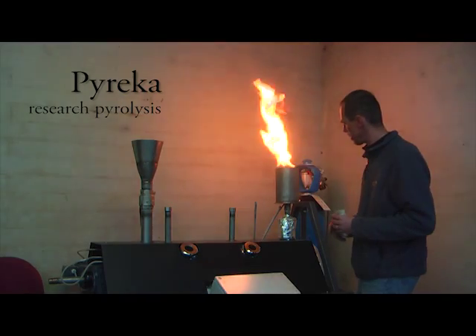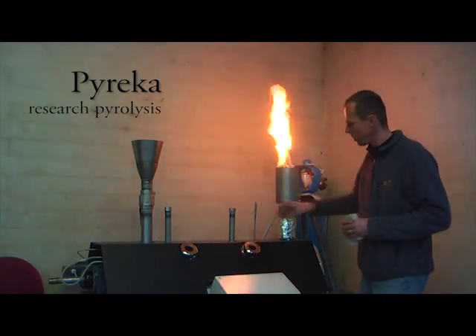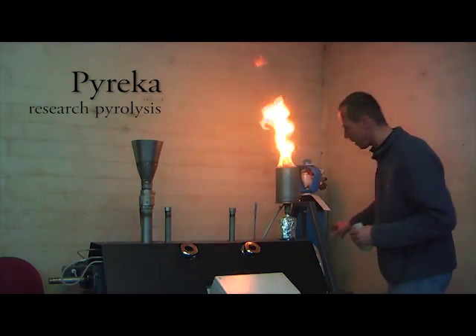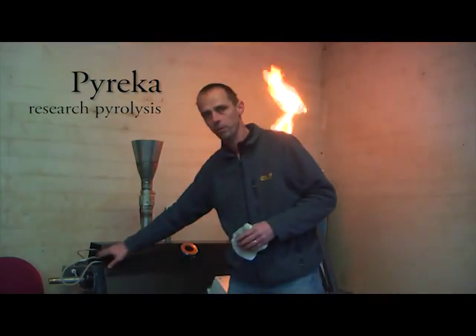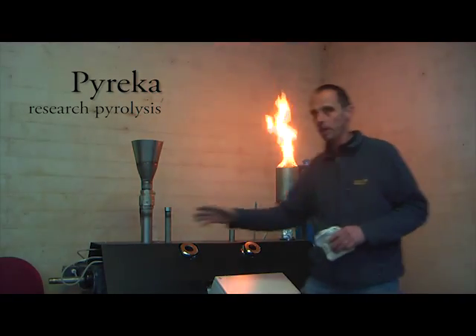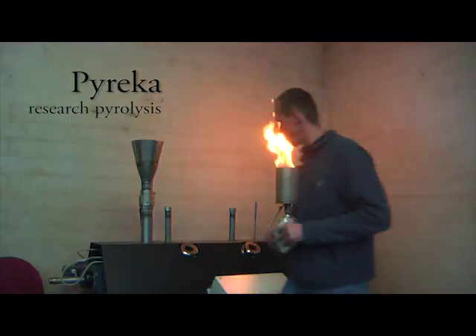We can give inert gas here that is heated up to the temperature of the reactor. We can give it at the exit of the biomass and give inert gas for the gas flow at the beginning. We have a hollow axis where we can get samples from the gas.